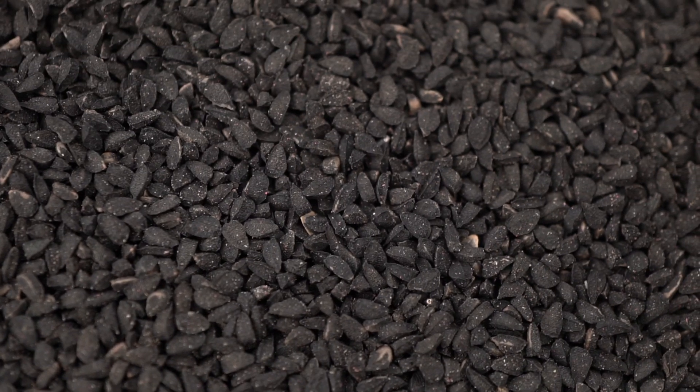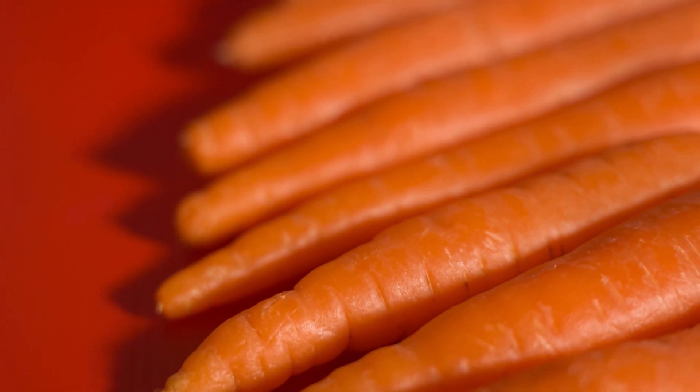Supercritical CO2 is applied for extraction of herbal extracts like black cumin extract, carrot extract, cardamom extract, ginger extract, and many more. These are all applied in the pharmaceutical industry, cosmetic industry, and also the food industry.